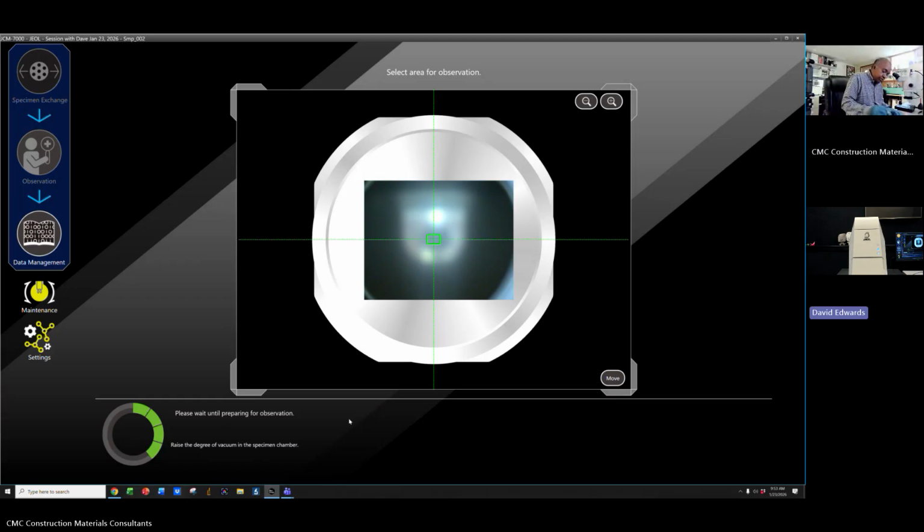Okay, it's not a focus problem. It's definitely not retaking the photo. So it's probably the camera issue. Okay, so I will contact George then. So while it is pumping, can I remove it by pressing the middle button again? Yep, correct. I can put my sample.